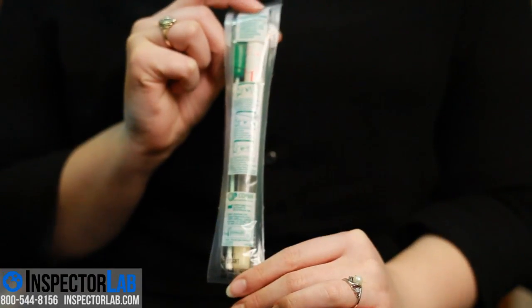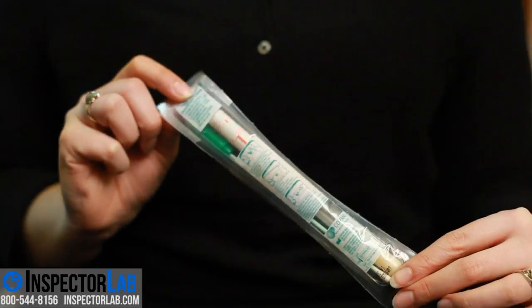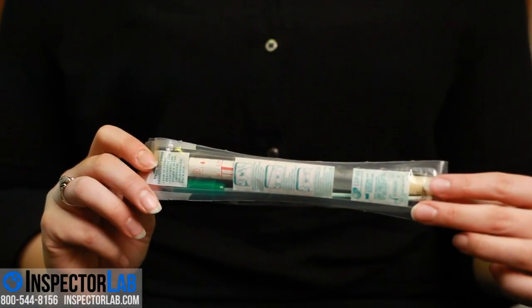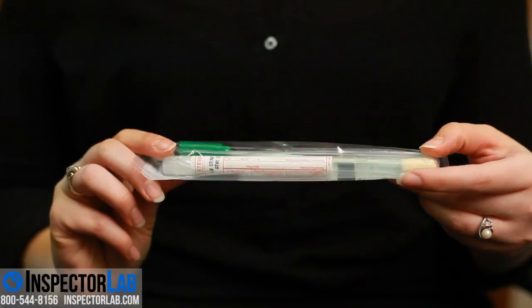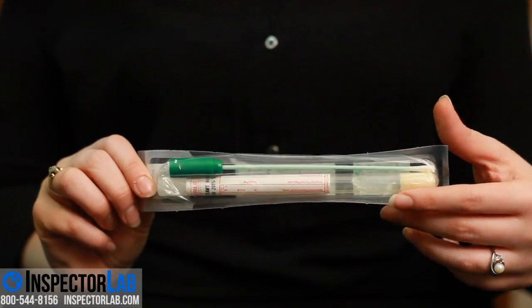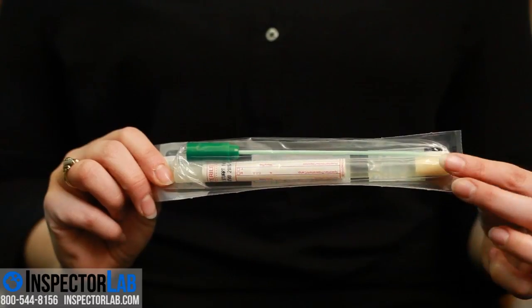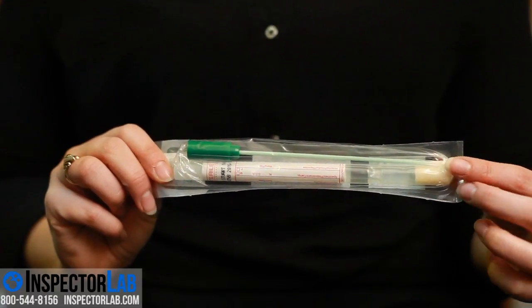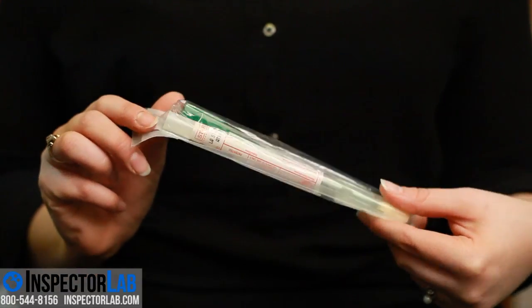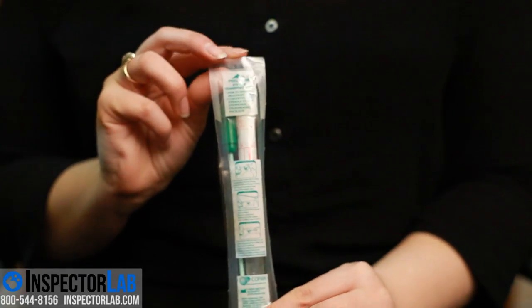A swab sample is a direct sample of any surface to determine whether a substance is mold, if it represents mold growth, and whether or not that mold growth is the origin of mold spores in the air as determined using air sampling cassettes. Swab samples will reveal the kind of mold on the surface and whether or not there is the presence of current or former mold growth.